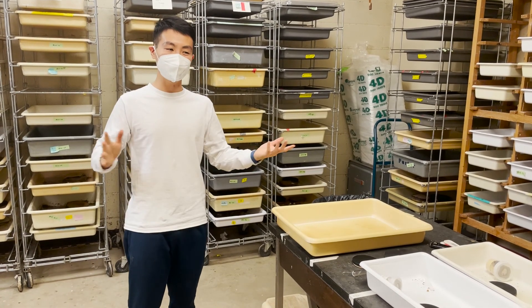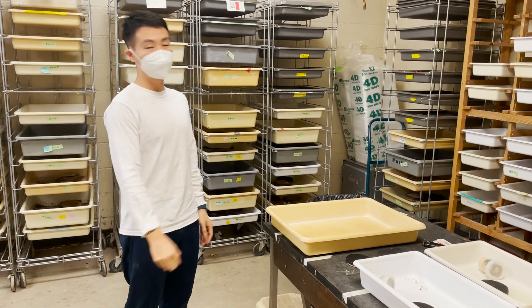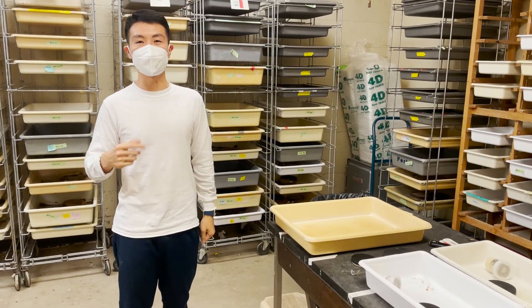Hello! In this video, I'll show you guys how we keep fire ants in the lab for research purposes.